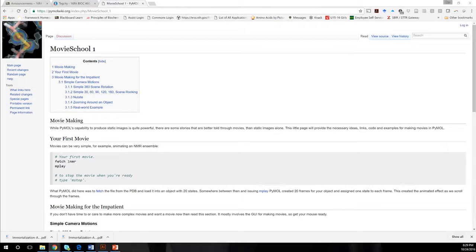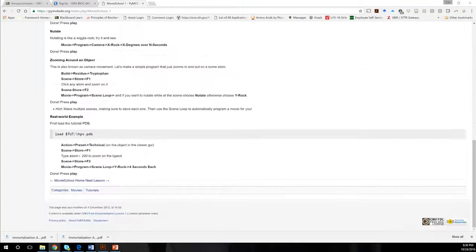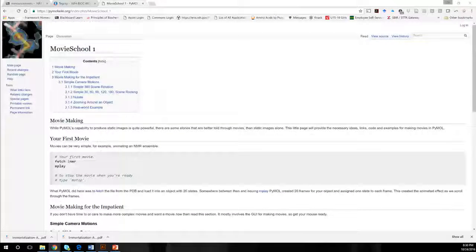Welcome. I'm going to show you today how to do some simple movie making in Pymol. If you go to this website here, you can just do a search on Pymol movie making. I'm going to take almost everything I do out of this website. I'm just going to show you how to do all the stuff that they describe in here. So it should be pretty straightforward.